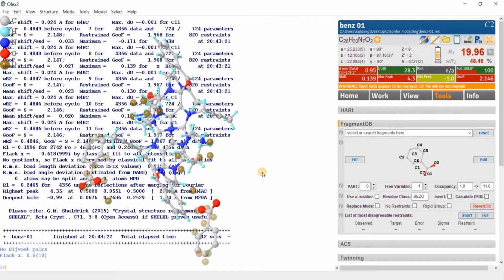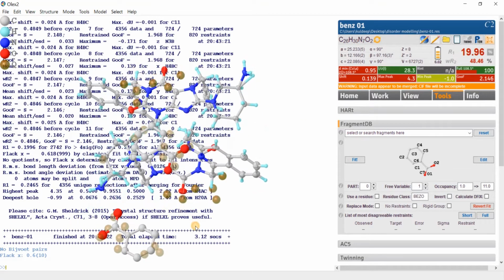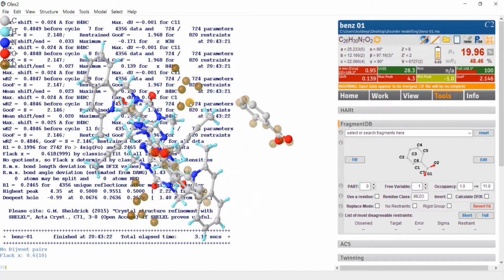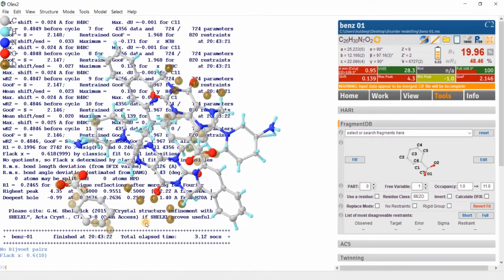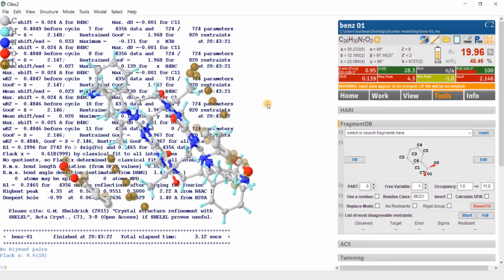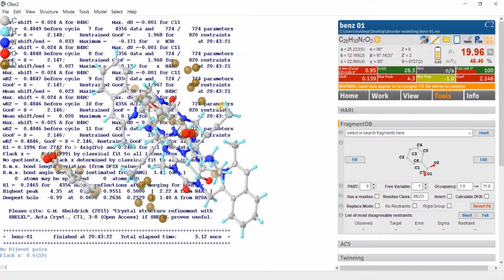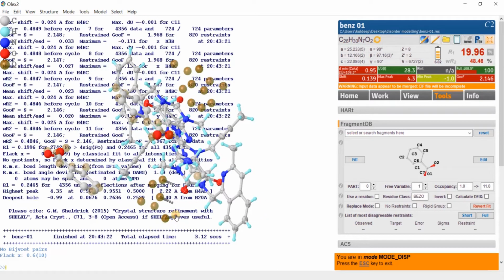Good. Now if I press this button compact, I am getting some electron density here with Q peak intensity 2.97, 3.44, 4.22, and the same electron density is appearing this side also. So what does this electron density indicate? Okay, press Ctrl G, grow, and you will find it's growing and it's also growing.